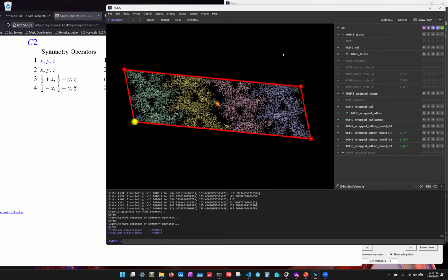Because when you're talking about proteins, it's a lot easier to visualize the full intact protein molecule rather than visualizing a piece of one here, a piece of another one here. So it's the same description, just for our convenience. Say there were all the other proteins around it. This is a snapshot of all the proteins as they fit into the unit cell, even though it's not full proteins fitting into the unit cell.